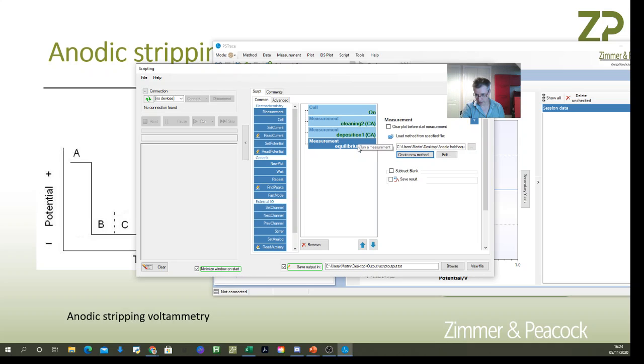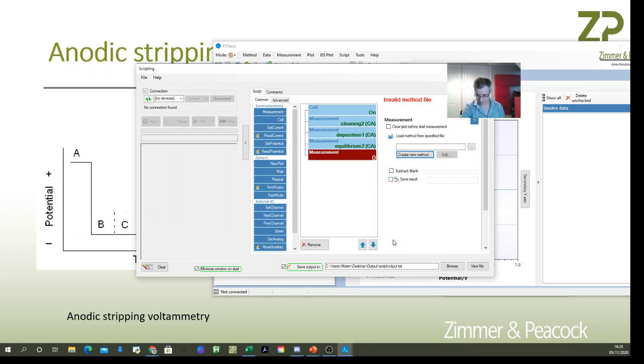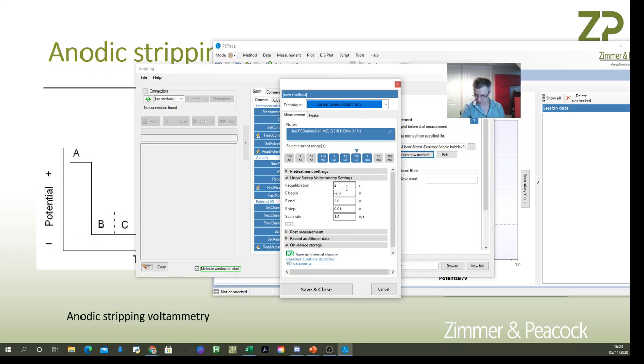The last step is the linear sweep voltammetry. I'll create it under measurements — let's call it 'LSV 3'. I select linear sweep voltammetry, set an equilibrium time of about two seconds, start at minus 1.5 volts where the last step finished, sweep to one volt, in steps of 10 millivolts, at a sweep rate of 10 millivolts per second.